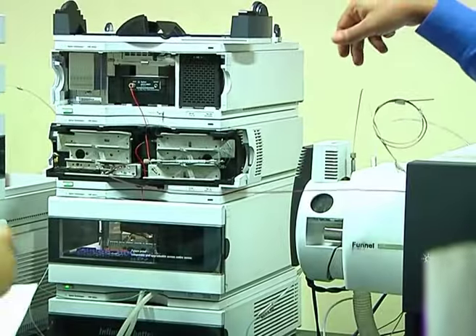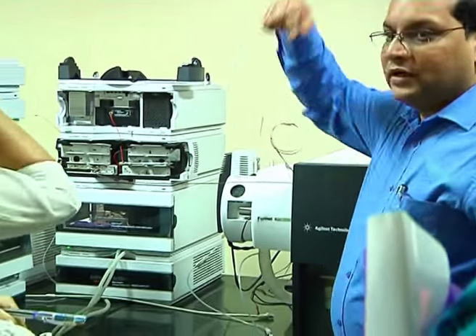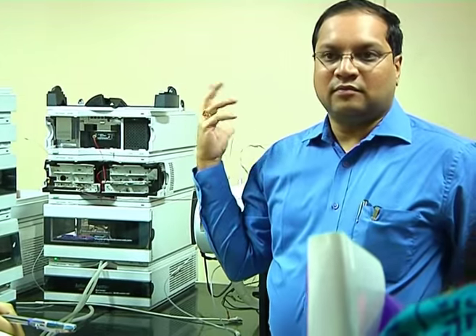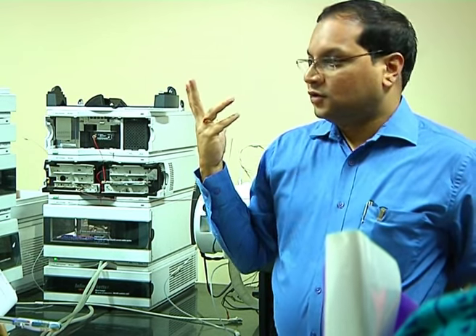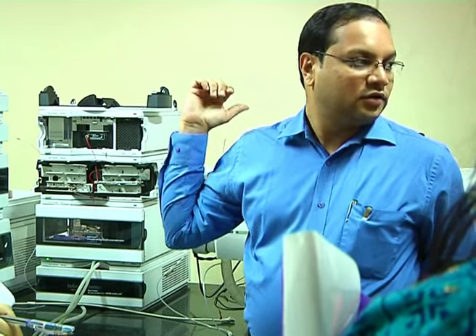So it goes in, and as you see, what is the output here? It's a stream of liquid. But what does the MS measure? Mass, ions. So the language it speaks is not understood by this liquid right now. We need some sort of device which converts this liquid into ions.